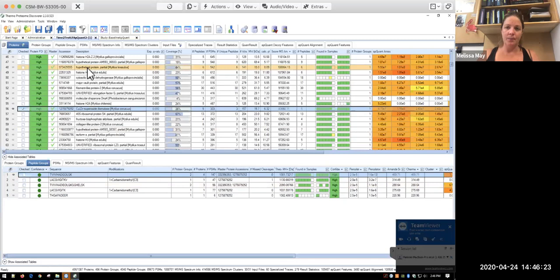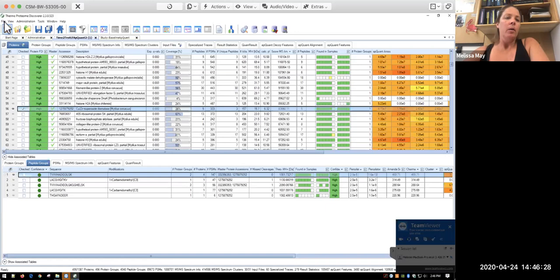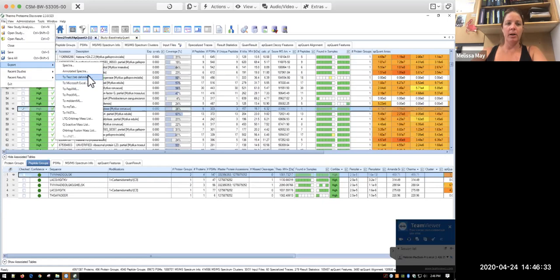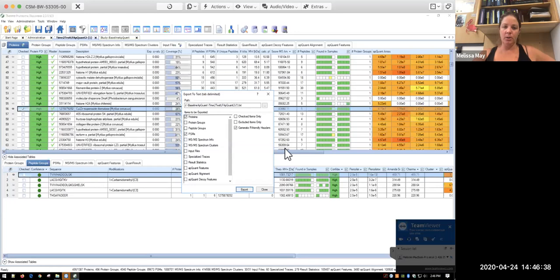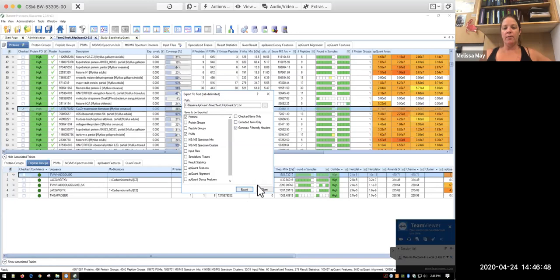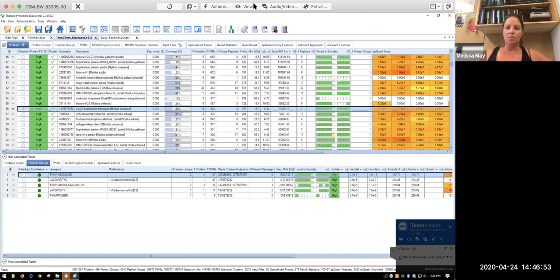So once you've generated this, you need to go an additional step. What you can do is go into file and go to export. And you can export, I like to do, to a tab delimited. And you're going to want to do the protein and the PSMs. You can download other data too, but you have this. And you can see that you're going to generate a text file that has R-friendly headers. And so if I go to export, it's going to give me this, and then I can import it into R.